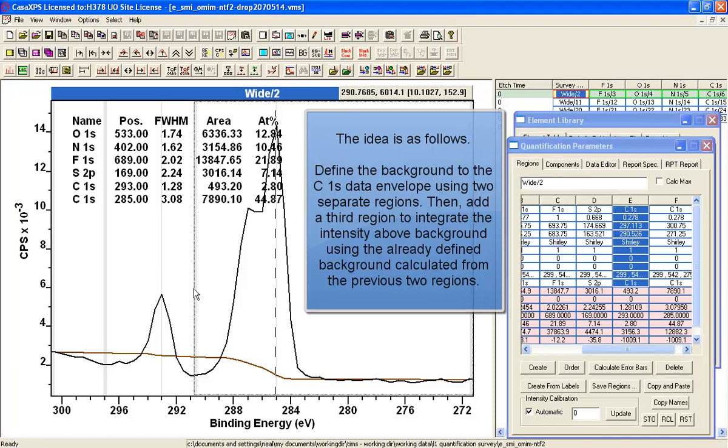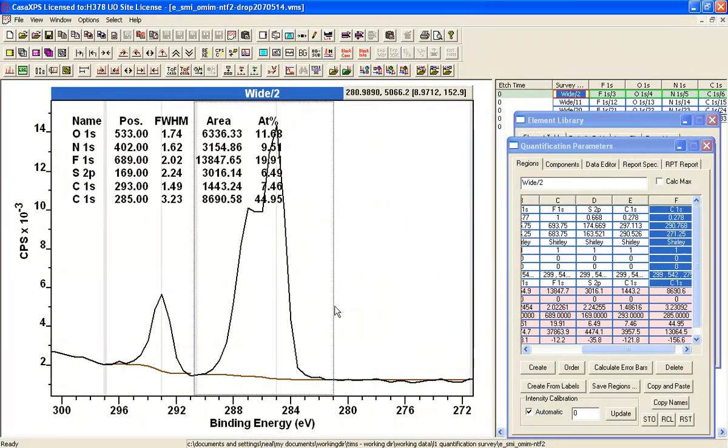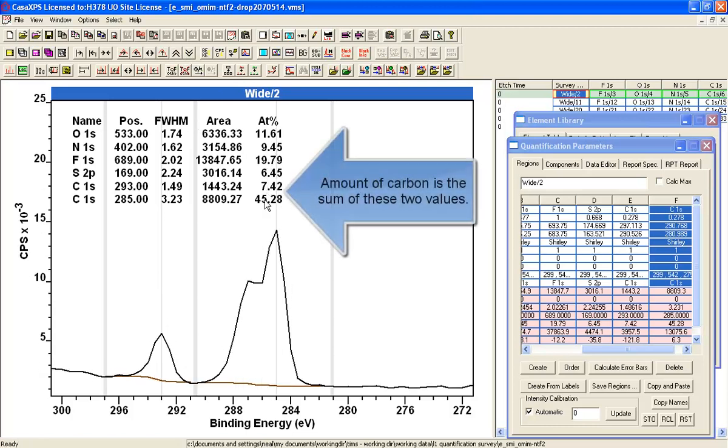So I've got two regions now to define the background. So I need to add these two intensities together to find the amount of carbon that I've got. These two numbers here must be added together to give me the carbon. Now, I could also do another little trick.